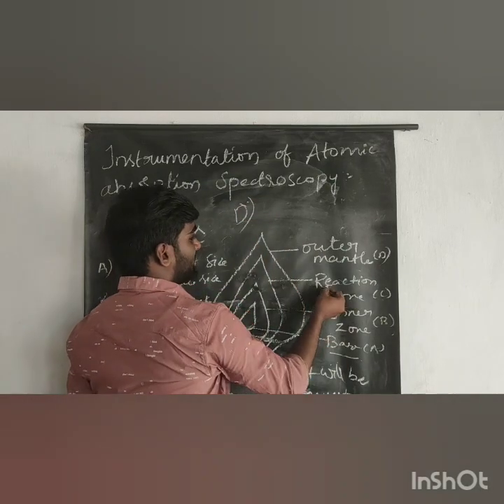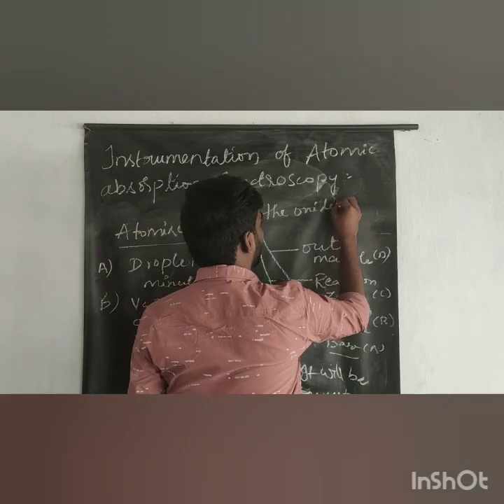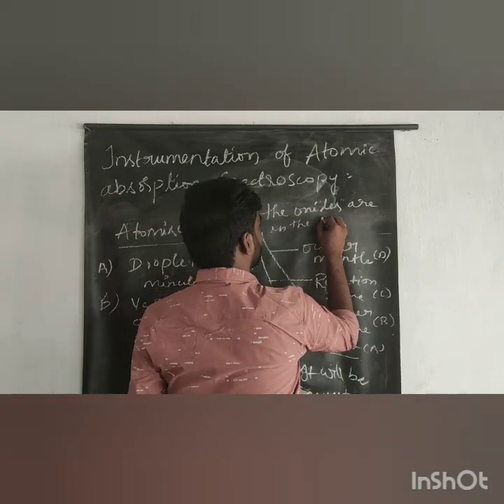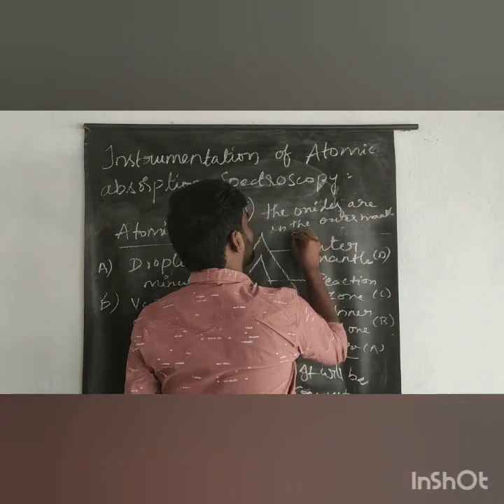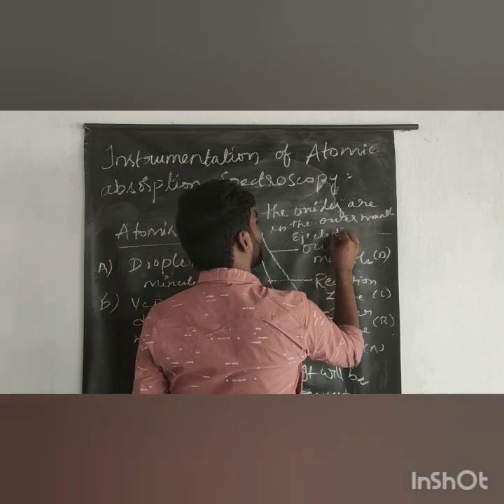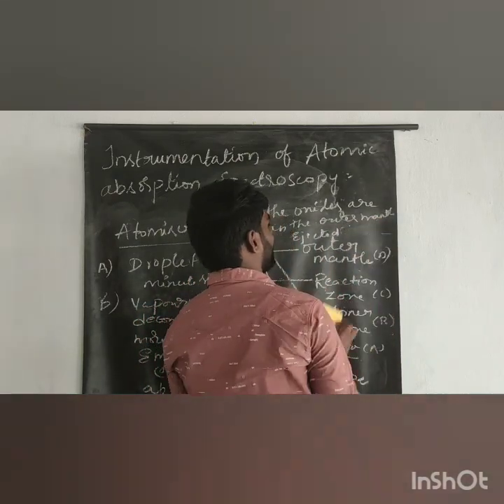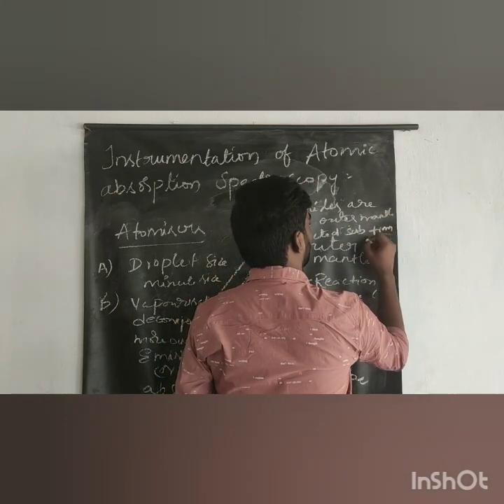So here the oxides are in the outer mantle, and the substrate is ejected from the flame.